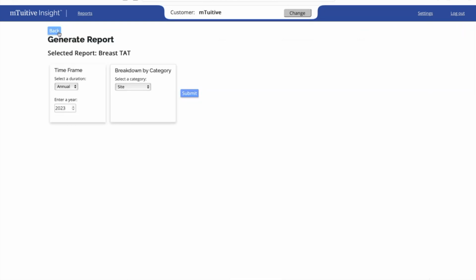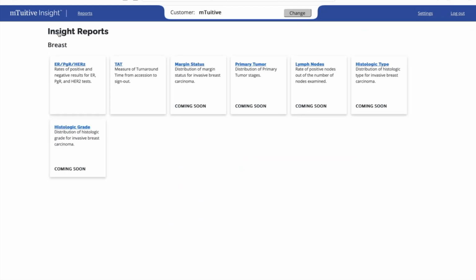So hope that gives you a good idea of how our reports work. You're going to see a common pattern emerge, with those demographics, breakdowns, and different things like that across all the different visualizations we do. But there are many, many unique types of reports in pathology, in cancer centers that people are requesting. And we're working our way through that list, and there's many, many more to come.